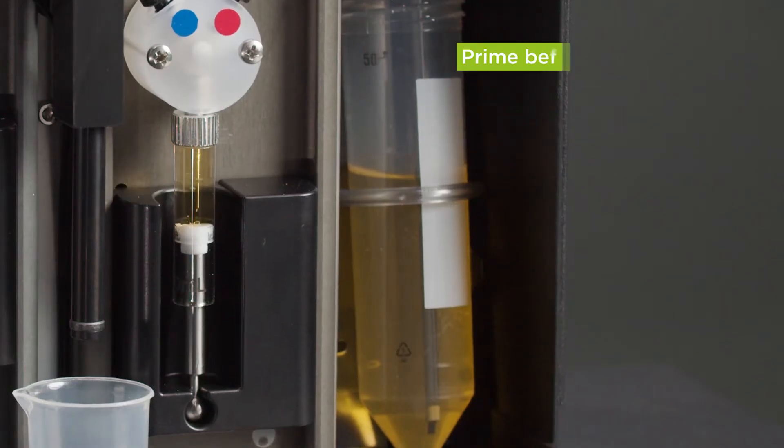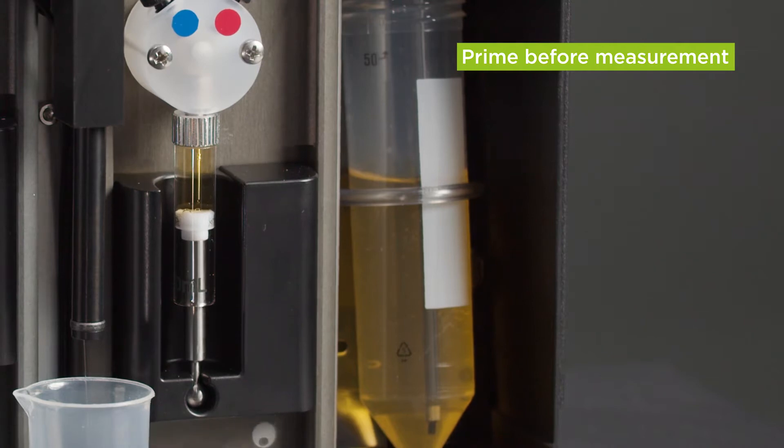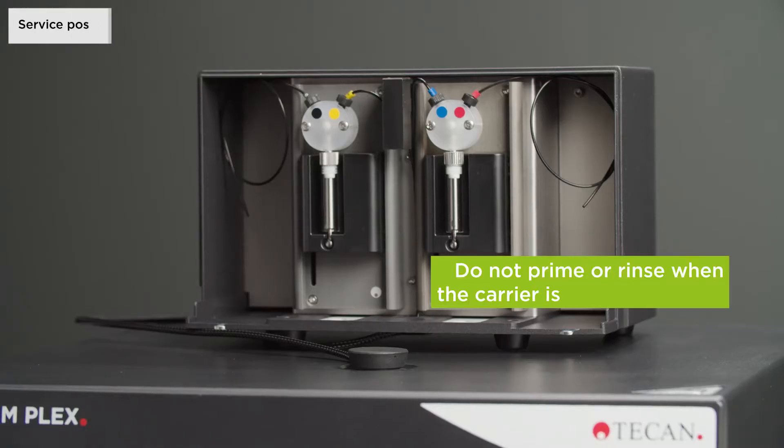Priming is necessary to fill the system with liquid before a measurement and to remove air bubbles from the tubes. Rinsing is needed to clean the system after each use. The injector carrier needs to be in the service position before priming, rinsing, or optimizing the injection speed.